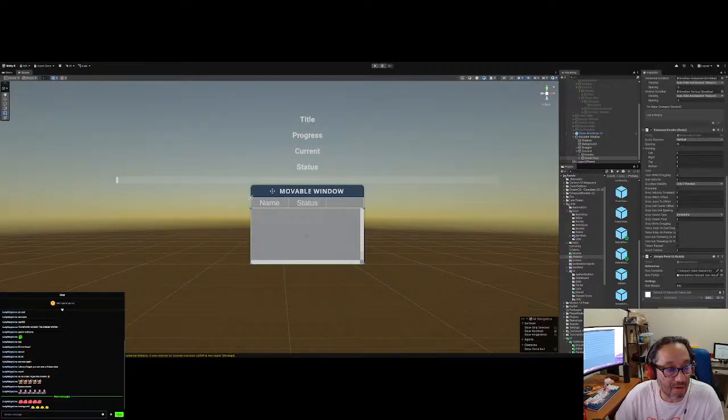It gives you any errors, and then it returns a completed task when it's done. When it's done, we create the samples async, right? As you see here, we have the queries and all that. These are the columns that we are trying to get. If you want to represent all these columns, you can.